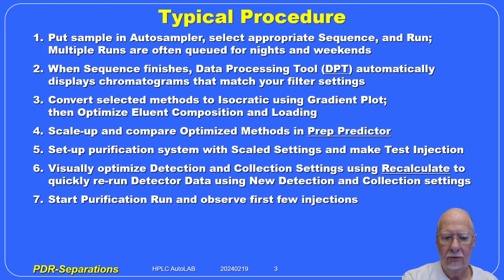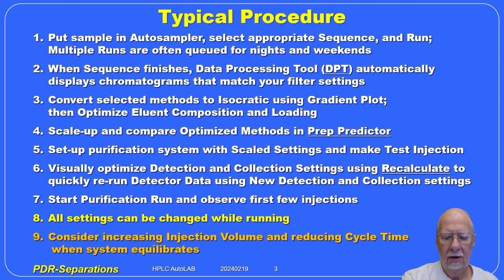Start purification run and observe first few injections. All settings can be changed while running. Consider increasing injection volume and reducing cycle time when system equilibrates.